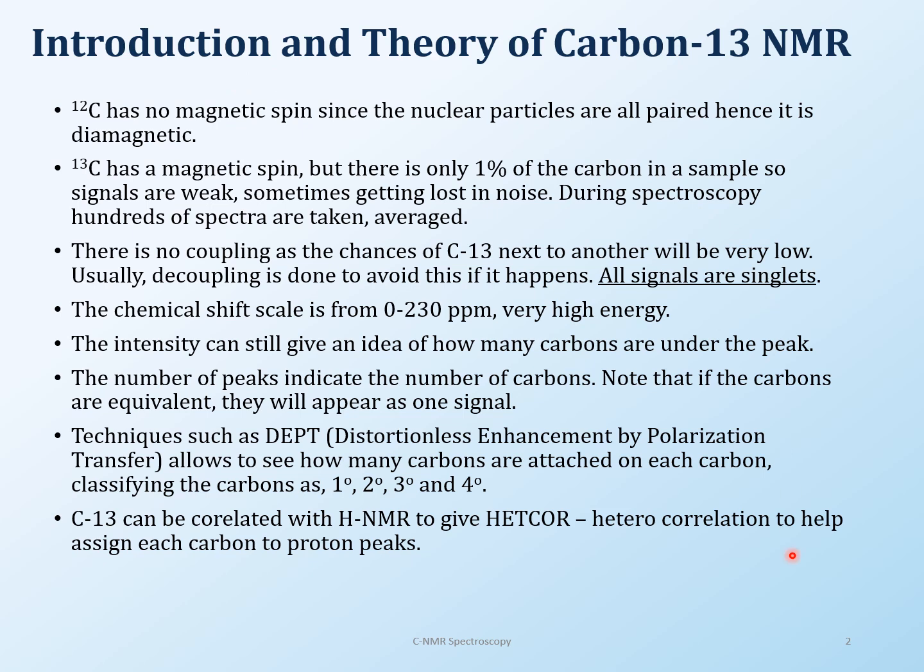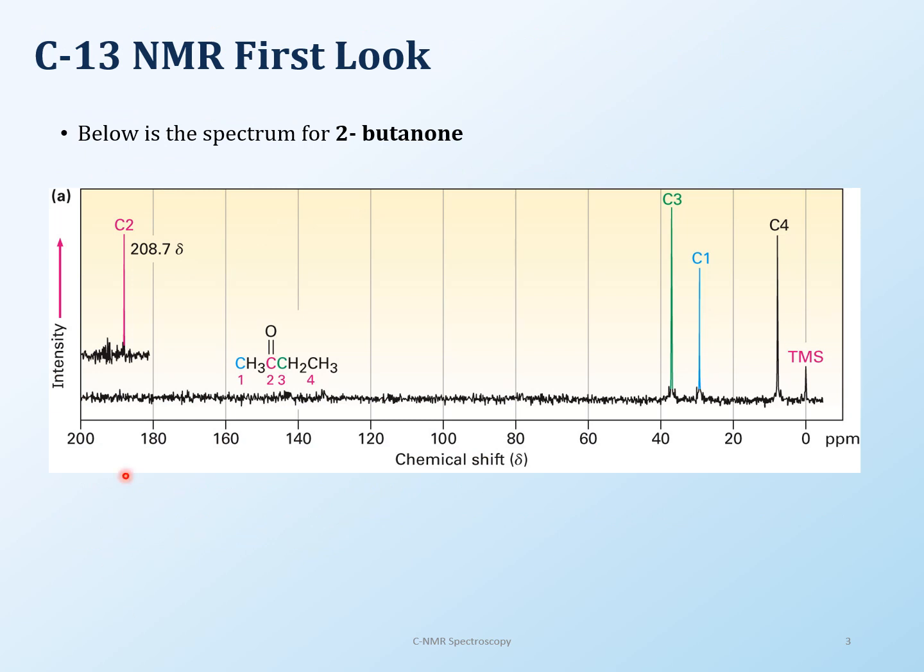Okay, so this is kind of like the basics of carbon-13. The theory I'm not going to go over that much again because it's the same thing as proton: you have a magnetic field, and the radio frequency is going to help resonate the nuclei.